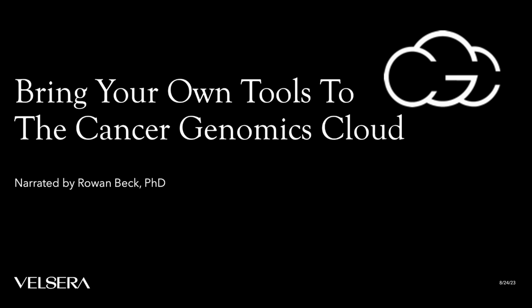Hello, and welcome to the Bring Your Own Tools video overview for the Seven Bridges Cancer Genomics Cloud, powered by Velsera. In this video, you will learn all about how to create tools or workflows on our platform.